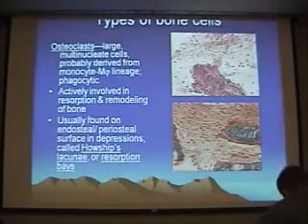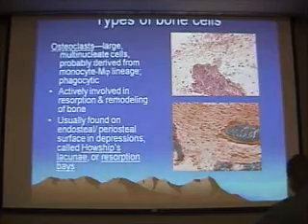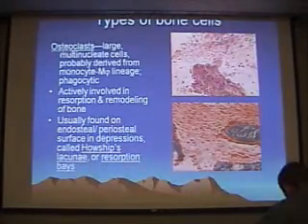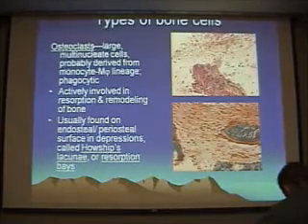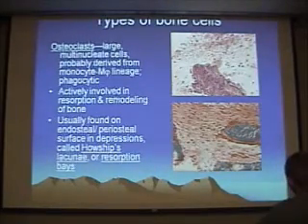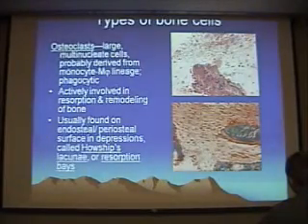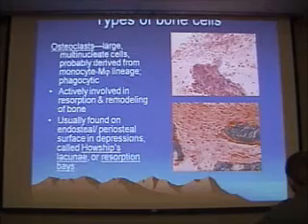Because these cells are literally chewing away at the bone, they are very commonly located in depressions on the surface of the bony spicules, and these depressions are variously referred to as Howship's lacunae or resorption bays. And so, while this one is actually chewing on a little process here, you can see this osteoclast is in fact in a little depression.